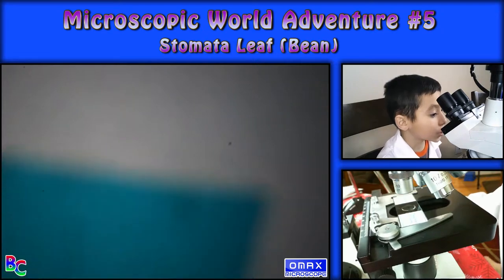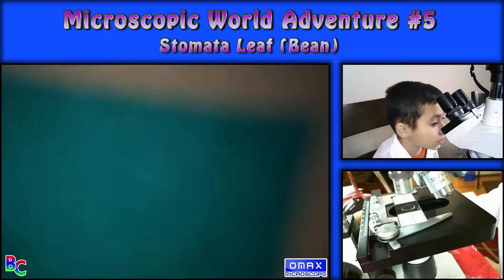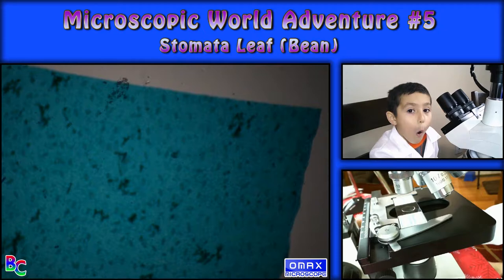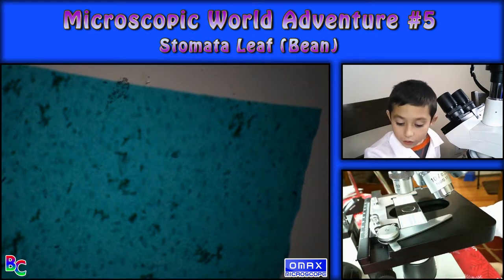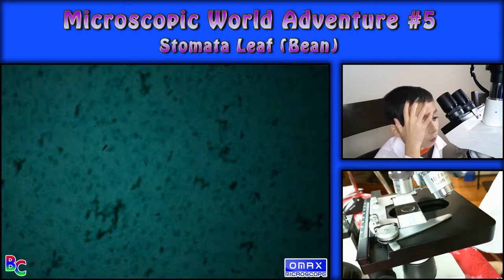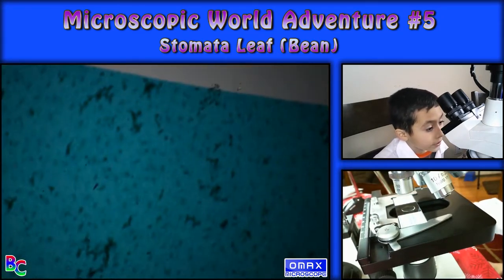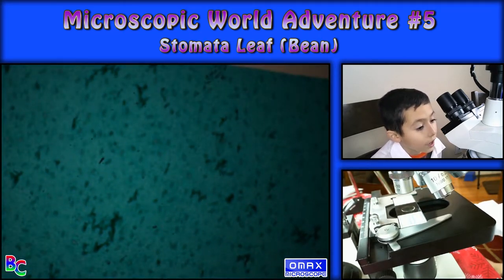I see a little bit of blue. Let's focus. Oh! I had no idea. This is ink — this is definitely ink. But what is that in the middle? Why is it changing color? First it was blue and now it's turning green again.